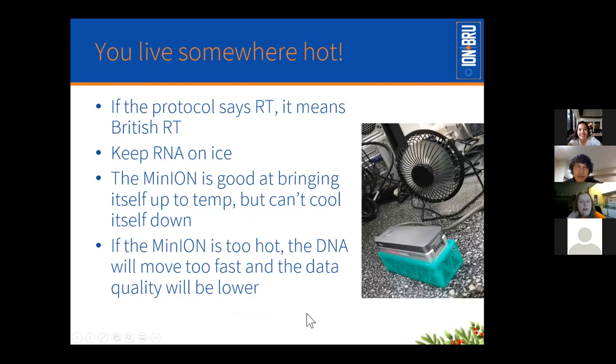You live somewhere hot. You're probably aware of this. It's hot where you live. And I'm sure you're used to protocols saying room temperature and not necessarily meaning room temperature. But definitely bear in mind that it's referring to British room temperature. And do keep your RNA and in fact most of the reagents on ice after they're thawed.